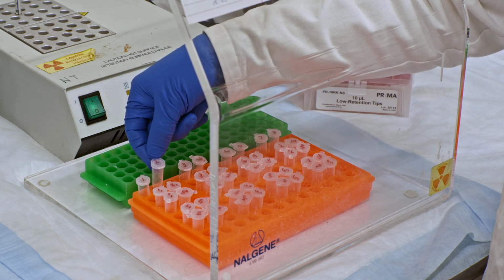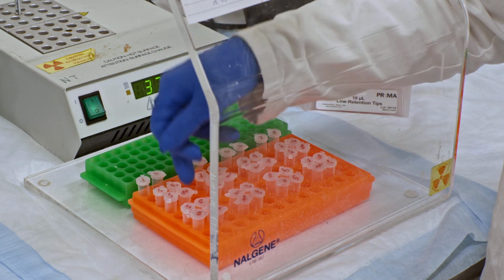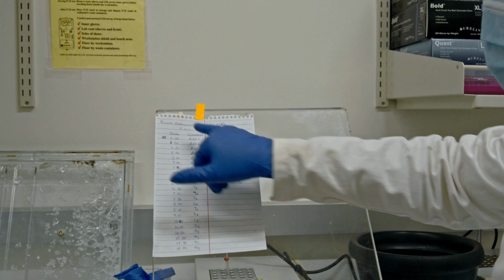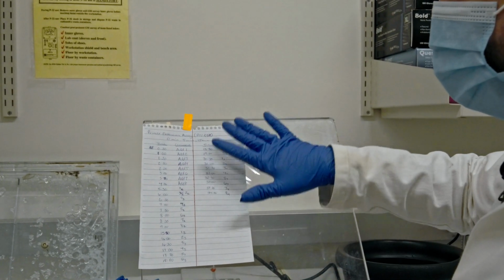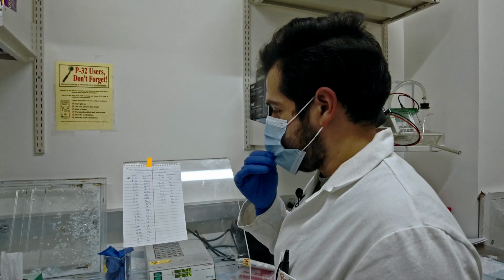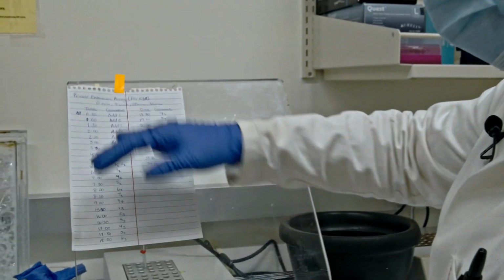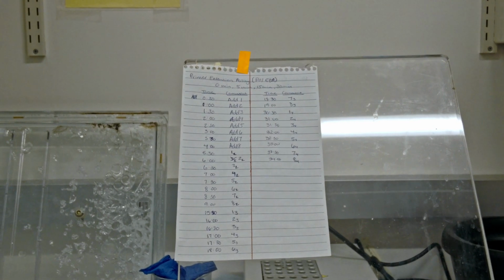The same numbering system goes for each other reaction vessel. So for example, if I picked reaction vessel 2, I have sample time points 2-1, 2-2, 2-3, and 2-4, and so on and so forth. Again, since I'm taking different time points here, at least for me, it helps to have a timesheet as to when I'm going to be picking out these time points. For these different time points, I've set up a way to efficiently get to each time point and not miss one, because this is, of course, critically important.